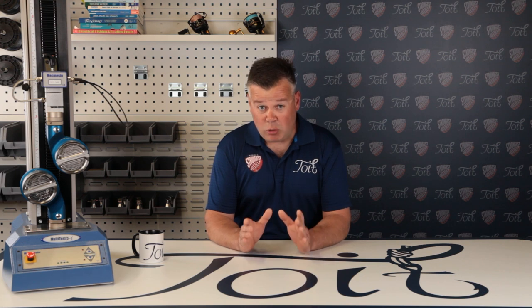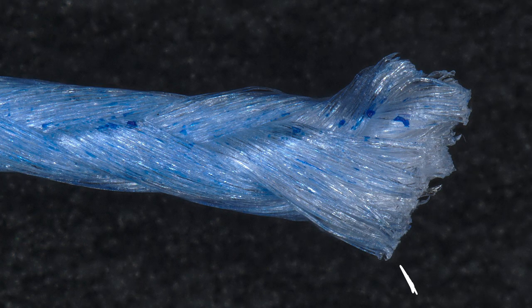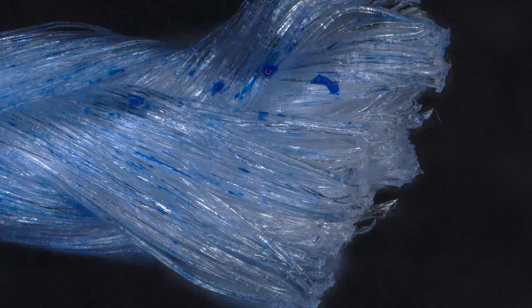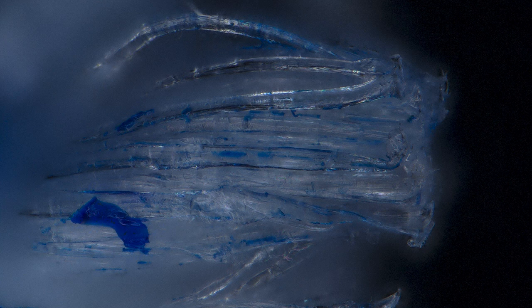Let's look at a piece of braid that has been cut or sheared with scissors. The first image is at 30x magnification, and this is 80x magnification. You can see that as the scissors cuts through the braid, initially multiple carriers are cut in a straight line, then the final two or three are cut at a slightly different angle — visible on many high carrier count and thicker braids, a bit like cutting hair bunched in a ponytail. At 400x, we measured the individual fiber at approximately 18 microns thick, or three-quarters of a thousandth of an inch. All individual fibers within a single carrier tend to be cut at the same angle — remember that for later.